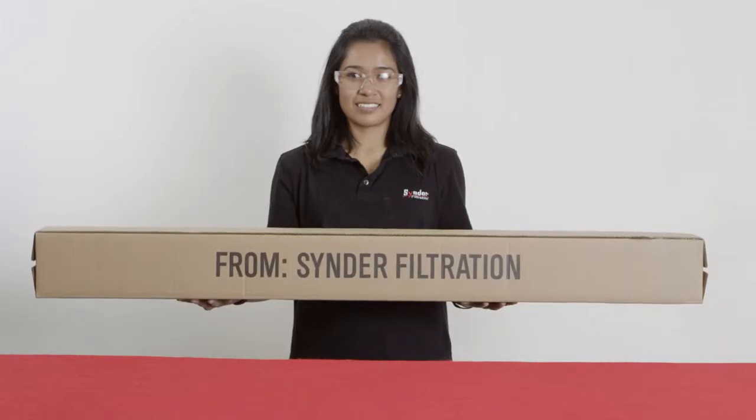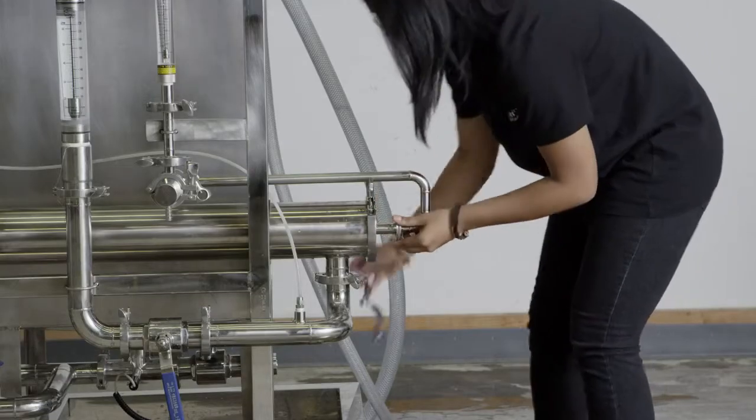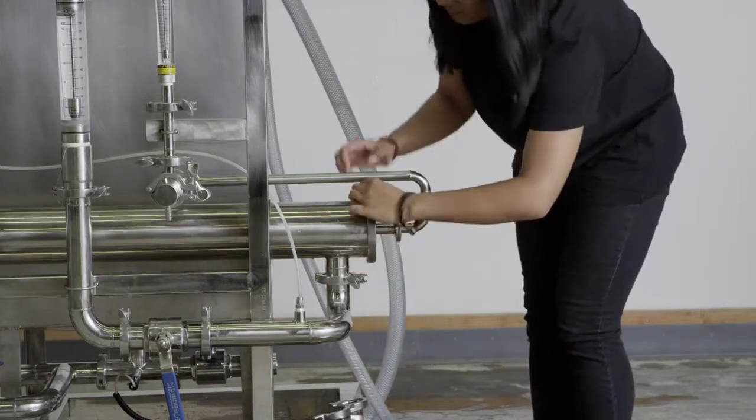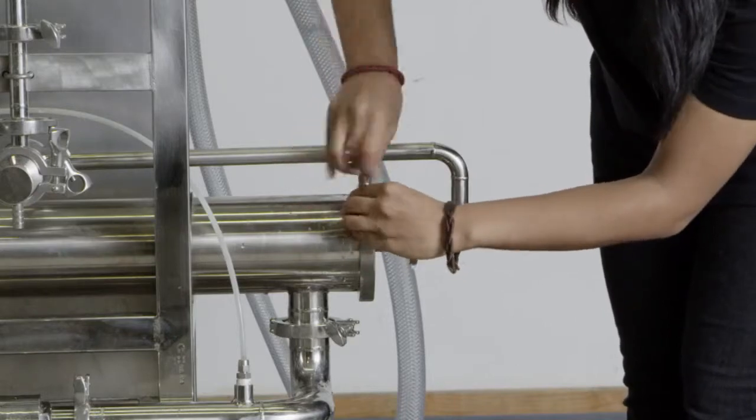After conducting a thorough cleaning of the elements and system followed by the final DI water rinse, flush the system with a preservative solution of DI water, sodium metabisulfite, and glycerin.